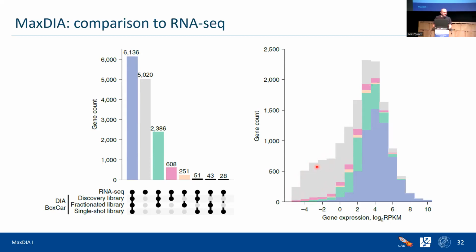Either because they're non-existent and just some statistical fantasy, or because the transcript is labile, or at least the resulting translated protein would not have a big chance to really exist for a long time. So it's actually a good thing. That's another check of the correctness of the algorithm, that we don't get proteins in this area.